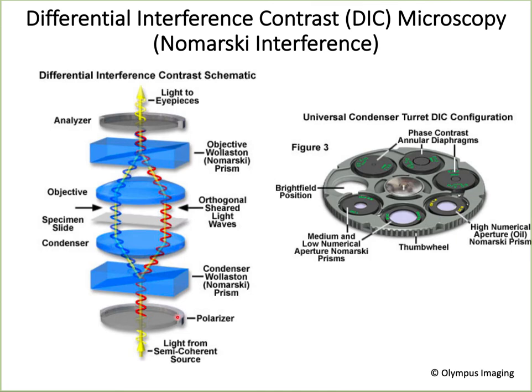So the differential contrast microscope contains the polarizing element typically encountered on a polarized light microscope, and in addition, two specially constructed birefringent compound prisms. These are known as Wollaston or Nomarski prisms. These optical beam splitters and beam combiners are positioned to project the interference pattern of the sheared wavefronts into the condenser in the front focal plane and to the objective near the rear focal plane.